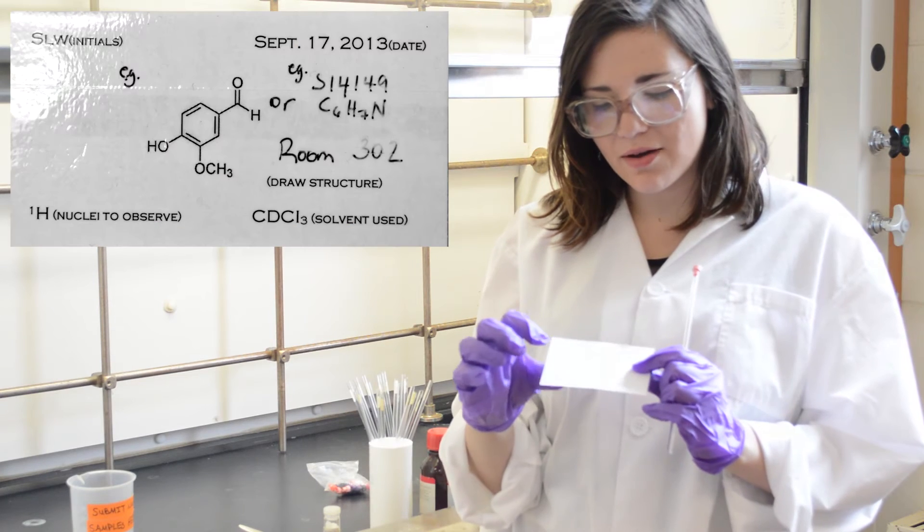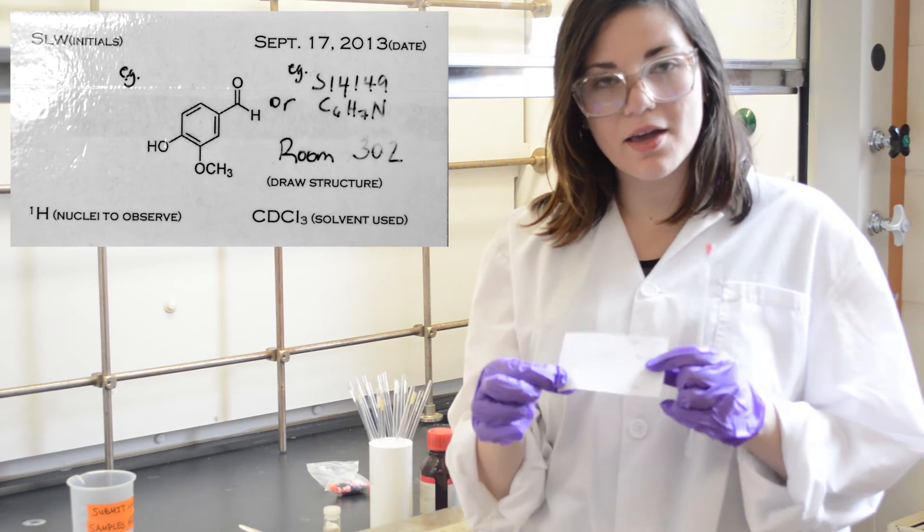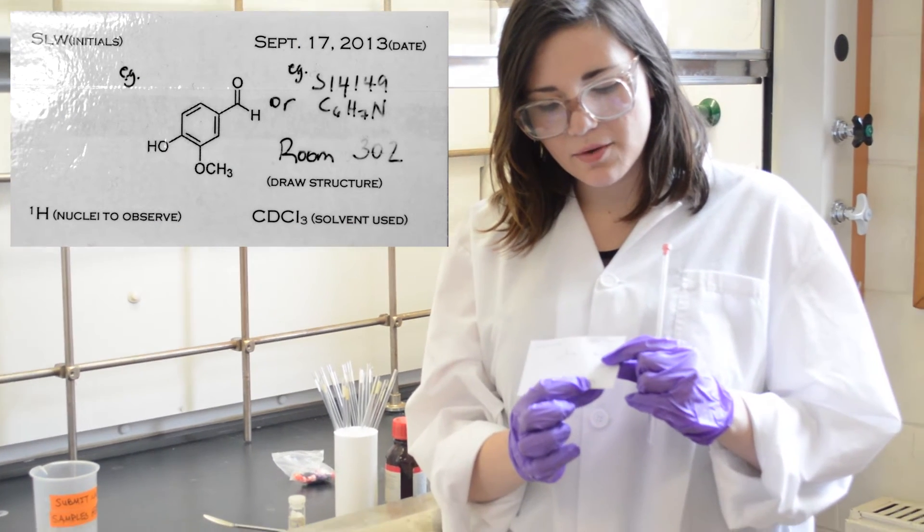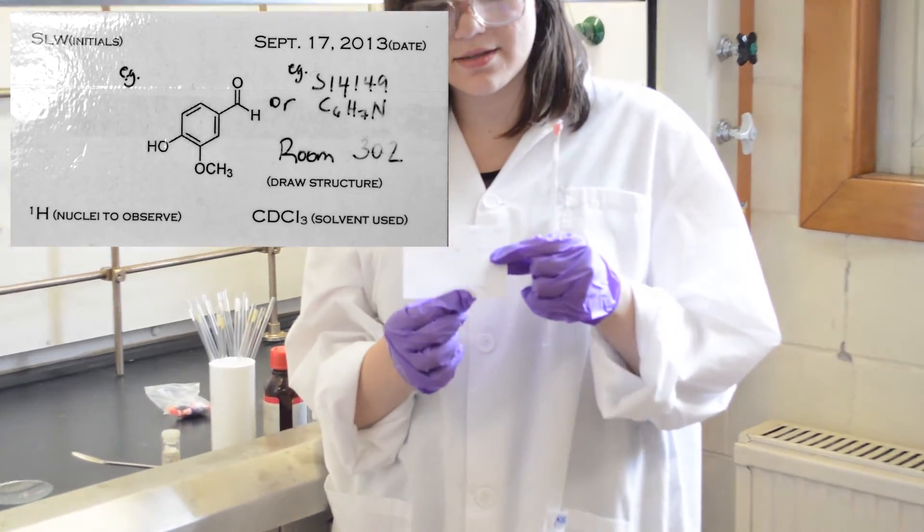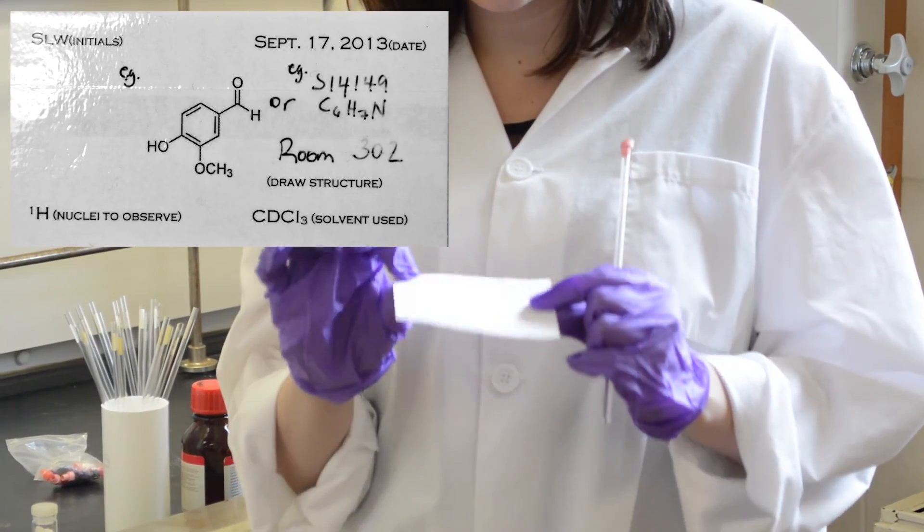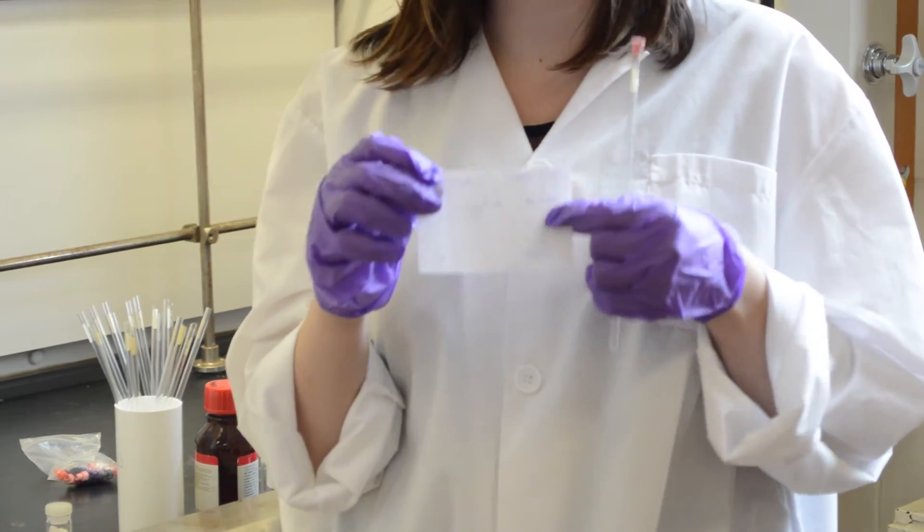Include a drawing of your compound, the type of nuclei you want to observe, the solvent in which it is placed—this deuterated solvent is chloroform—the date, as well as your initials, so that it can be returned to you.